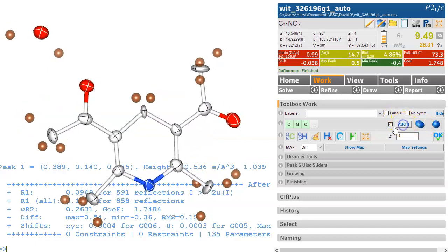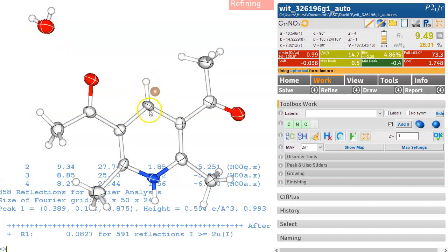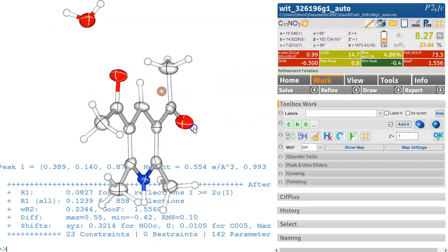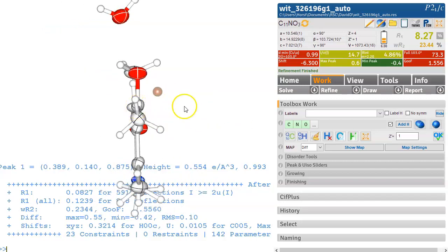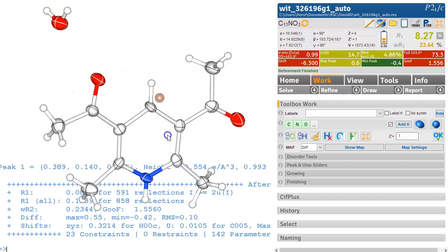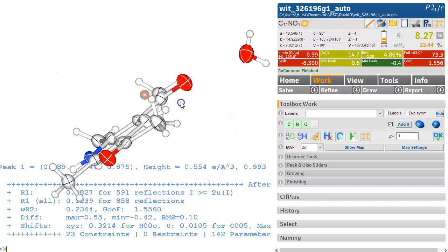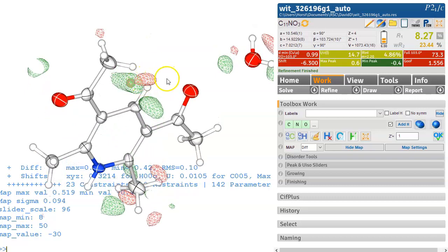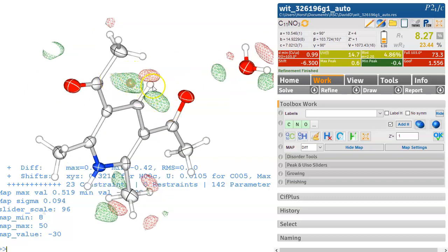So if I click H add in Olex2 it's probably going to add one hydrogen and if you look at this from a chemist's point of view you'd probably assume this is a phenyl ring rather pyridine ring but actually if you look at the distance it's 1.516 so this is clearly an sp3 hydrogen carbon atom but it looks like it should have one hydrogen but Ctrl M also tells you quite clearly look at that so it's too much electron density assigned in this region and not enough in these regions.